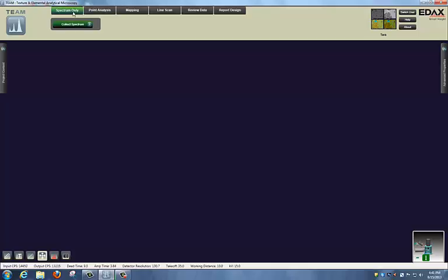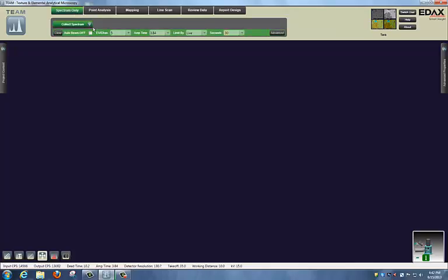The Spectrum Only tab is the most basic of all the data acquisition areas. This allows us to collect spectra from wherever the active area of the SEM beam is from the microscope controls. So if you have a full area raster or a reduced raster or even spot mode activated from your SEM controls, the EDAX software will collect the spectrum from those areas. The options associated with the Collect Spectrum button are located just below the button.